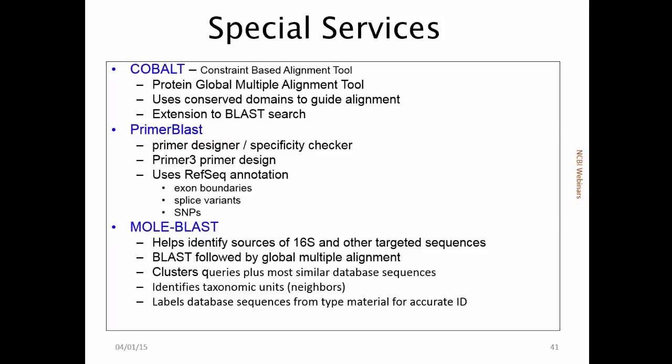That's a useful thing because remember what I said about multiple alignment tools. You need to know that your sequences are related to each other. BLAST will tell you that. You can take a BLAST output and feed it into Cobalt to make a multiple alignment.